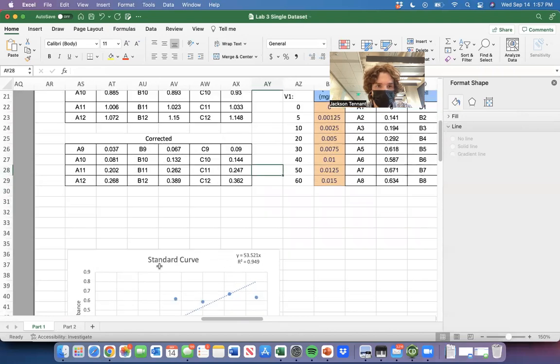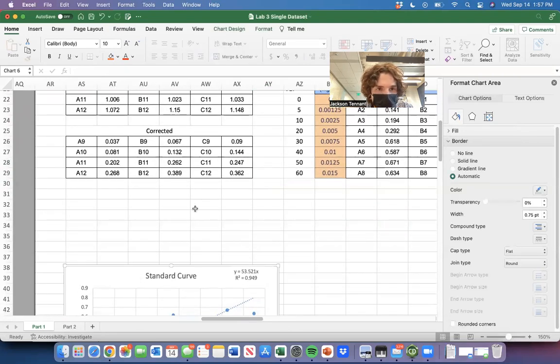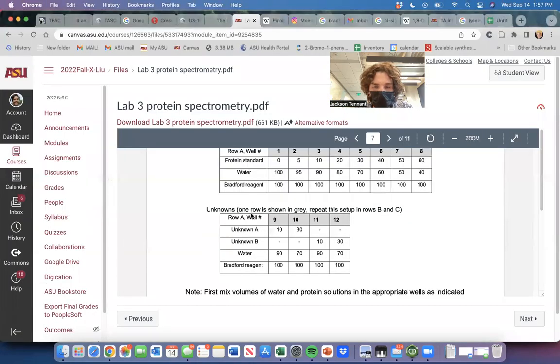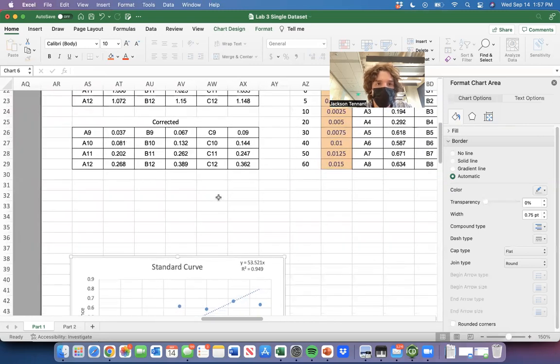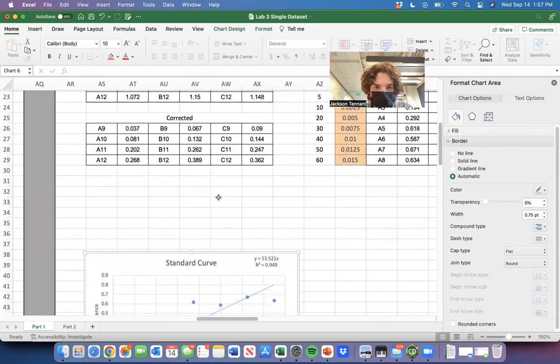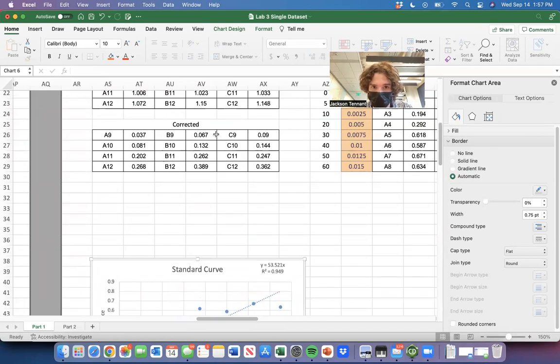So awesome. Now, okay. So this is supposed to increase, and indeed it does increase. These are supposed to increase, and indeed they do increase. Great. So what I can do is I could either do this calculation for all three of these. I don't know what your protocol tells you to do. Do whatever is on Canvas. But what I'm going to do is I'm going to average these out.